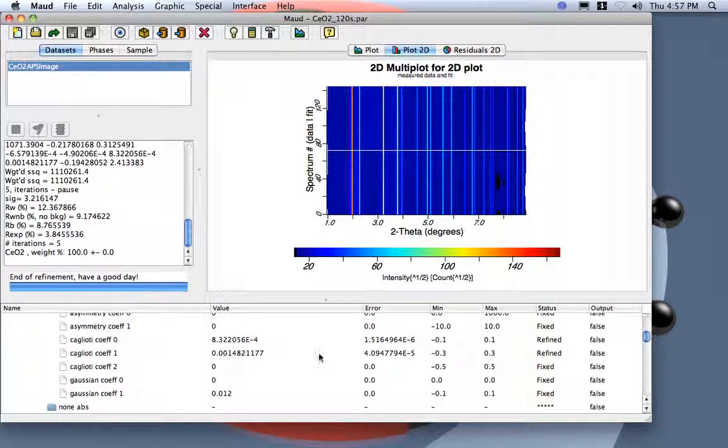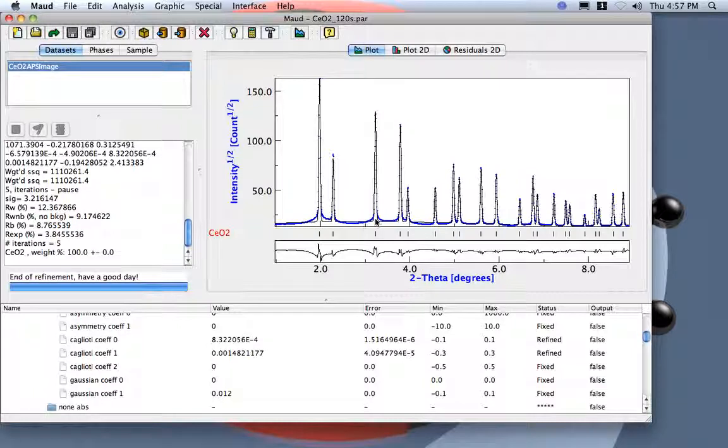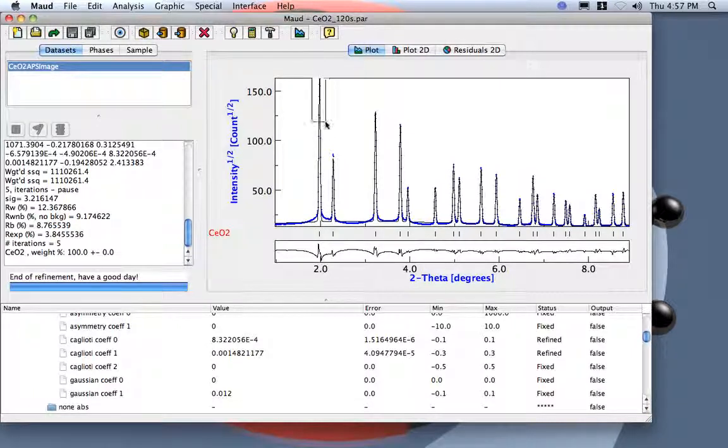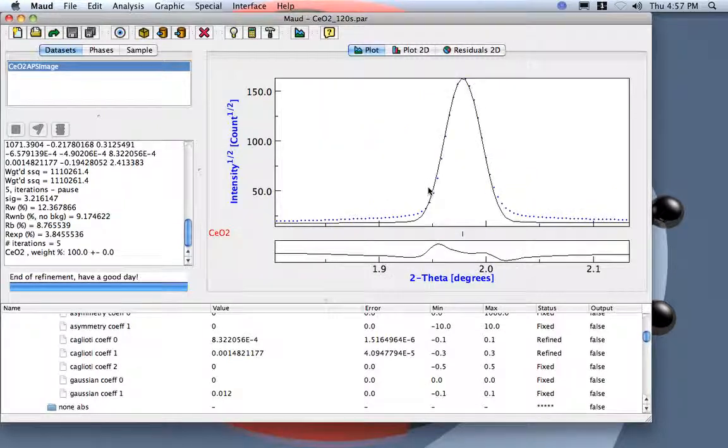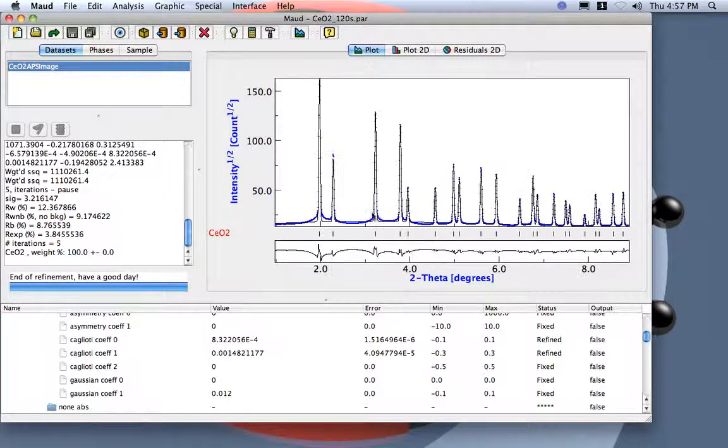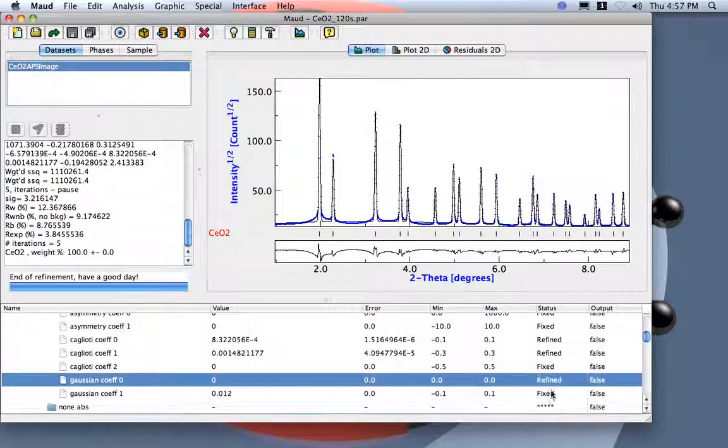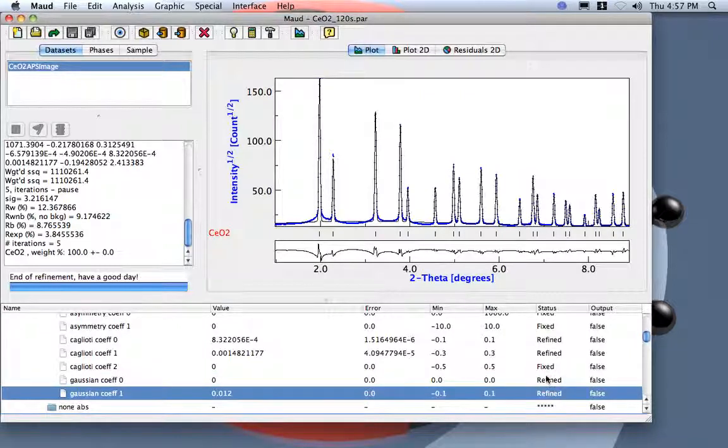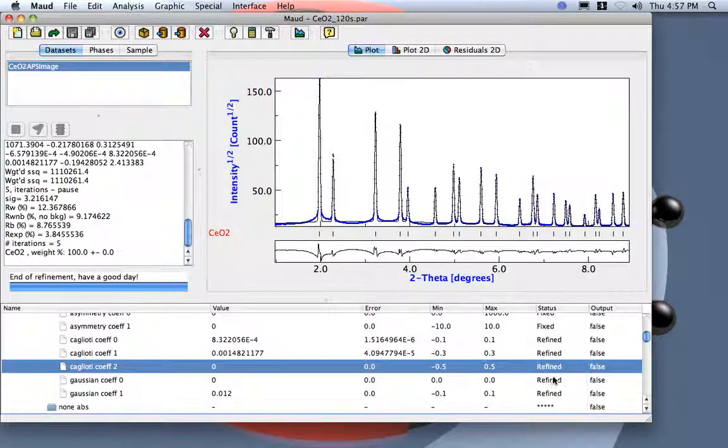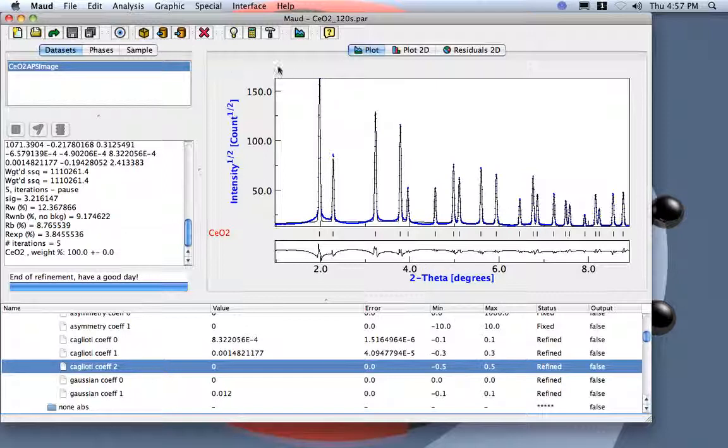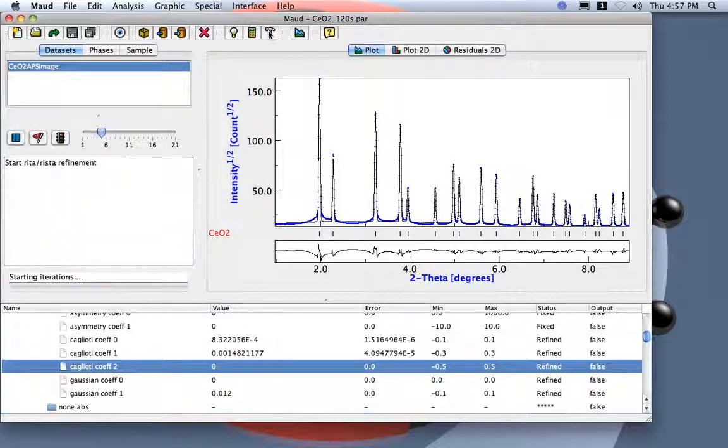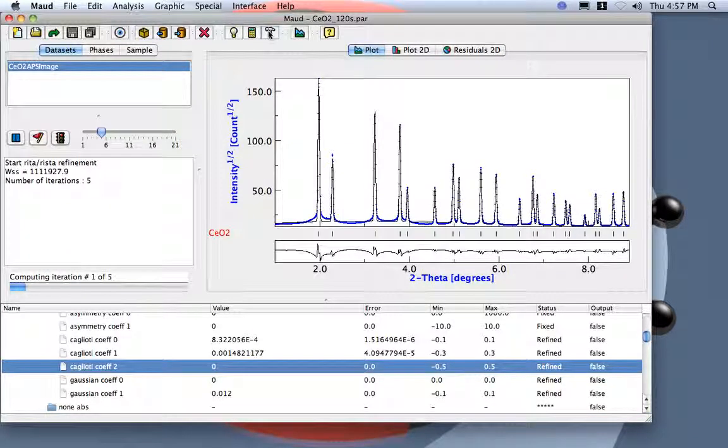Now we have the Cagliotti. If we look at the plot over here, I am not satisfied with the peak shape. And so we can refine for the Gaussian part here, and probably it's a good idea to put the third Cagliotti coefficient here. Let's start again and see if we get some more improvement.